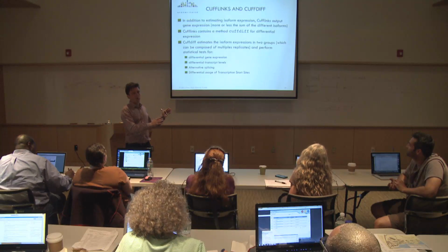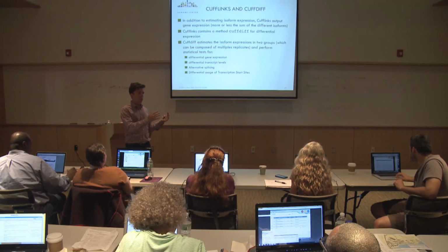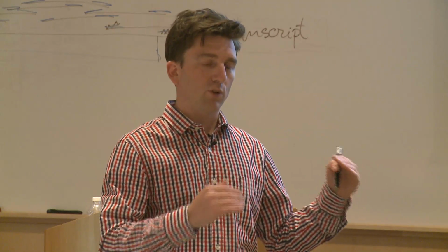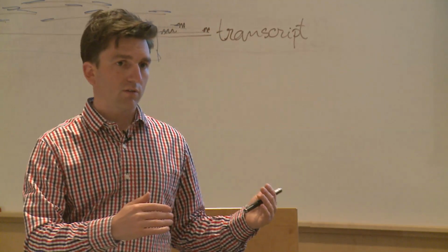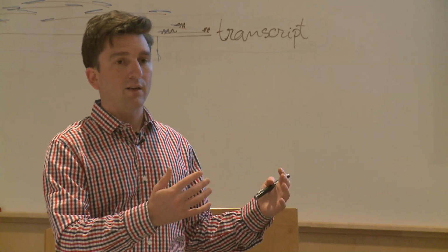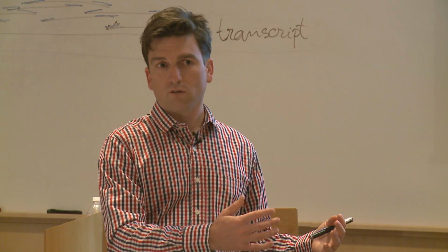And I can describe another way that's actually in a way more simple, that stays at the gene level, where you don't go at the transcript level, and you really try to capture different expression in genes between the two conditions. And for many experiments, that's sufficient. That's what you want. Now, you also, theoretically, with RNA-Seq, you have access to isoform resolution, right?